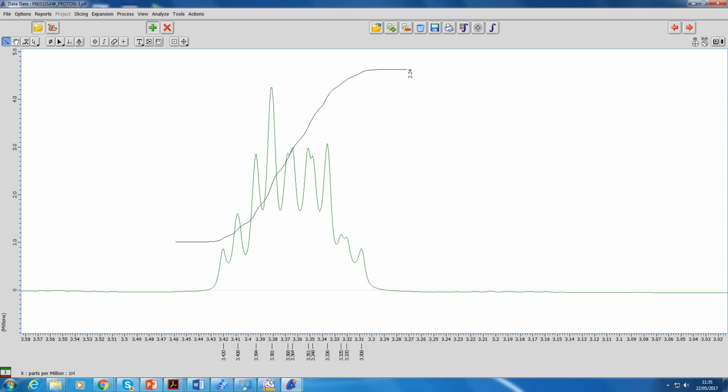So what I'll do is I'll just use Alt to line these up so there's no chemical shift in X between the two, which is seen in the bottom left corner. Yeah, bottom left there. Oops, not quite 0. It's a bit tricky to do actually. I won't worry too much, but something like that.